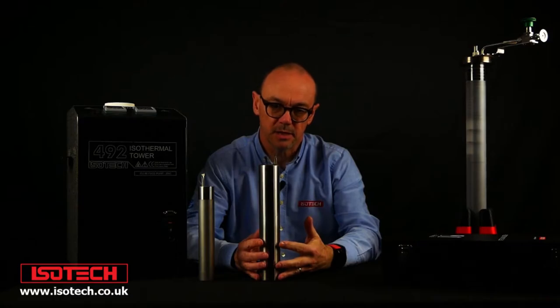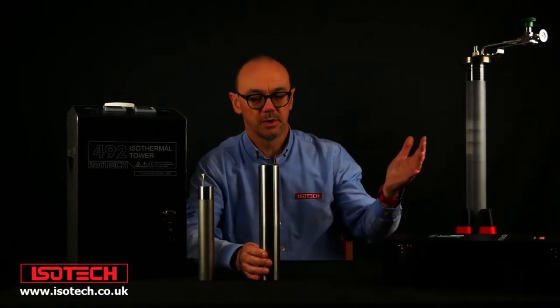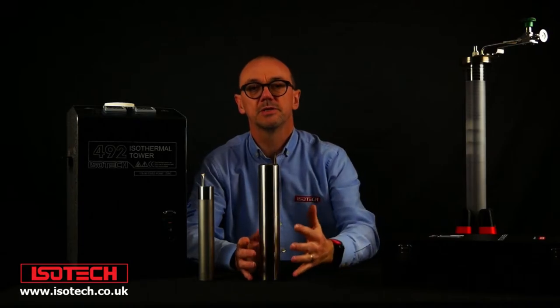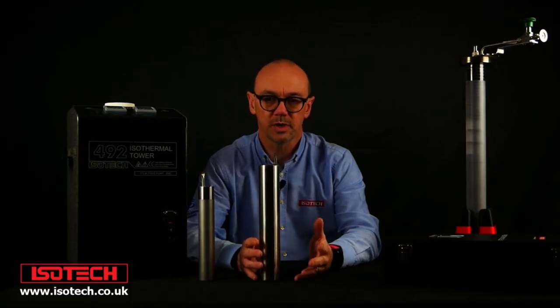Metal clad cells are more robust than the quartz glass type. But traditionally ITS-90 fixed point cells have been made in glass cases. At Isotech we can offer up to the aluminium point in a choice of metal clad or quartz glass.